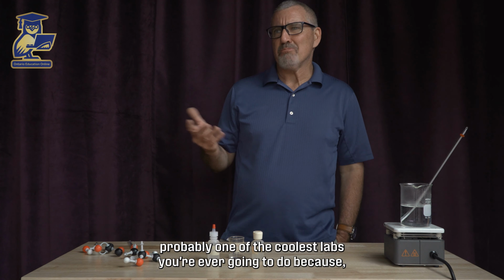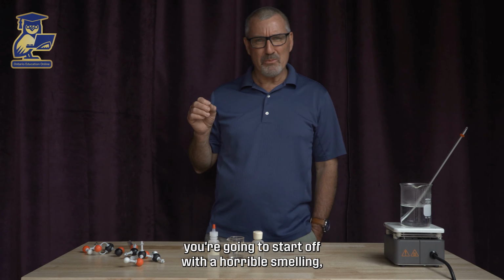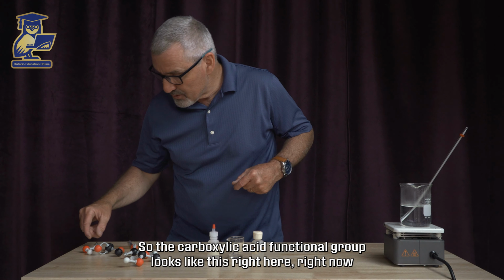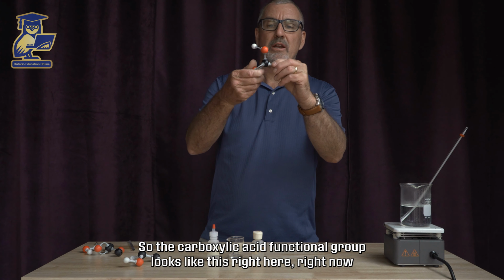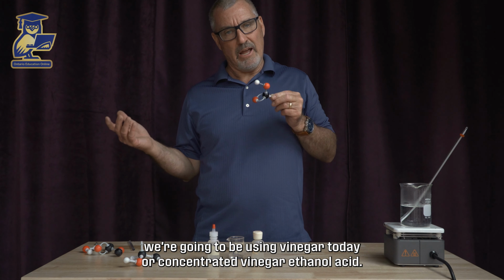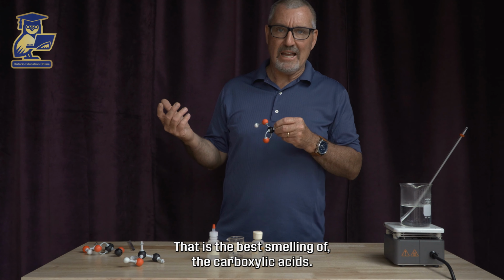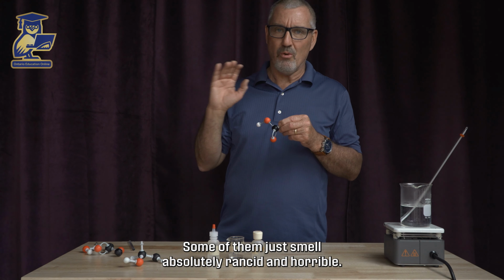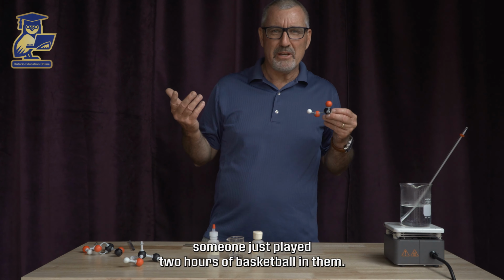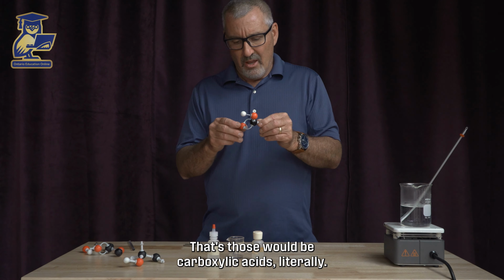The cool thing here, it's probably one of the coolest labs you're ever going to do, because you're going to start off with a horrible smelling carboxylic acid. The carboxylic acid functional group looks like this right here. Now we're going to be using vinegar today, or concentrated vinegar, ethanoic acid. That is the best smelling of the carboxylic acids. Some of them just smell absolutely rancid and horrible. Think of well-worn sneakers that someone just played 2 hours of basketball in. Those would be carboxylic acids, literally.